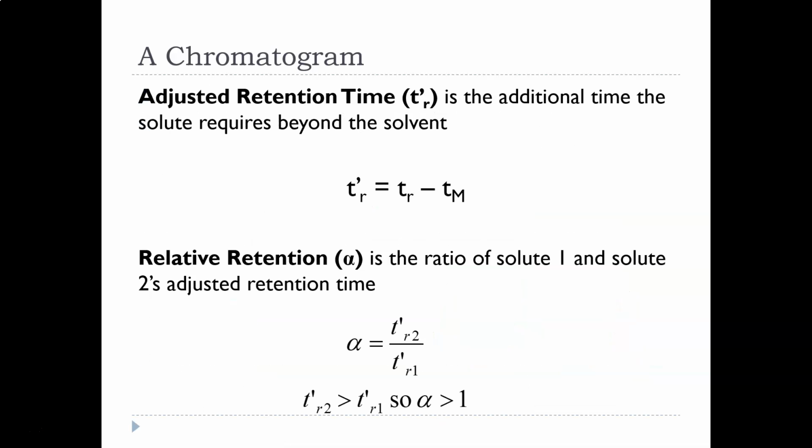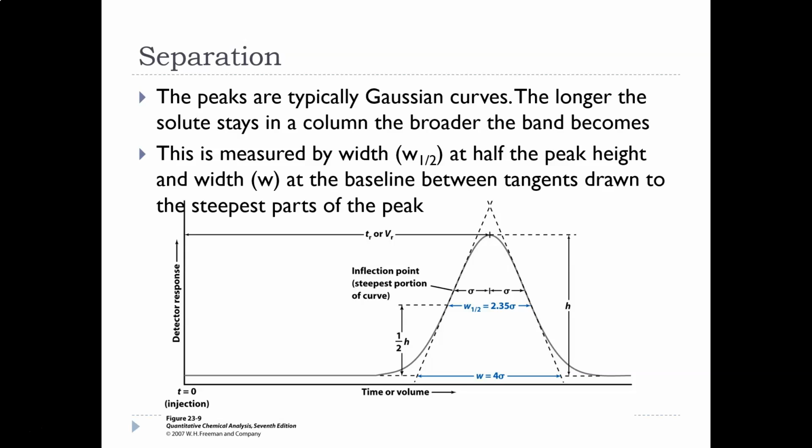Okay, so getting us back to where we were. We were here. So we have these peaks. Now these peaks are shaped like Gaussian curves. Oh man, that was all the way back to statistics in chapter 3 or 4. So we see that there's a highest point and then they're typically symmetrical on each side. And so again, they look like Gaussian curves. The broader, the wider the curves are, that's not great. We would like them to be very narrow, so very pointy. So their width is something that we can measure. Their width is, how wide is it? That was a good line right there.